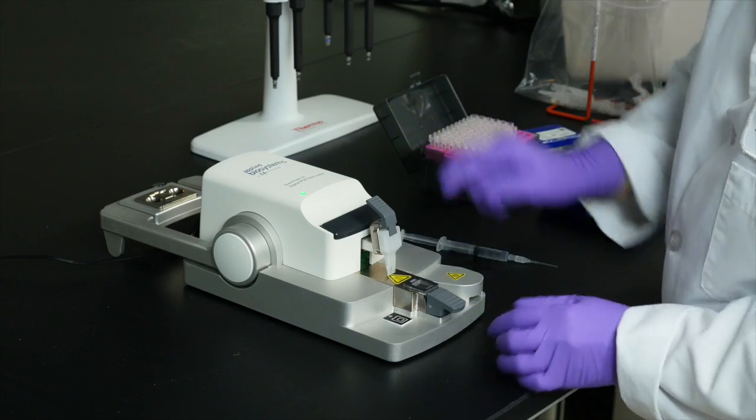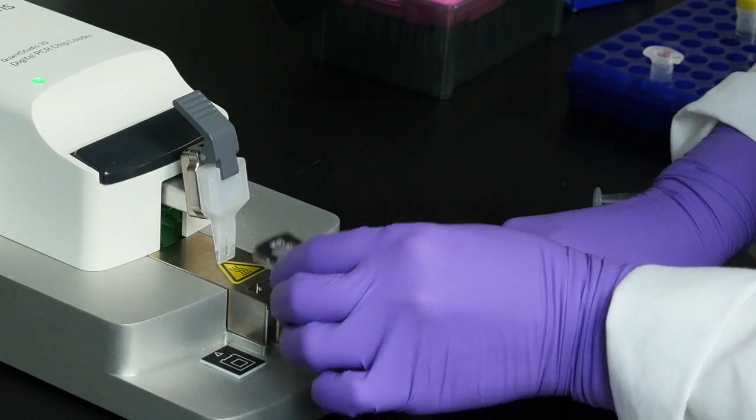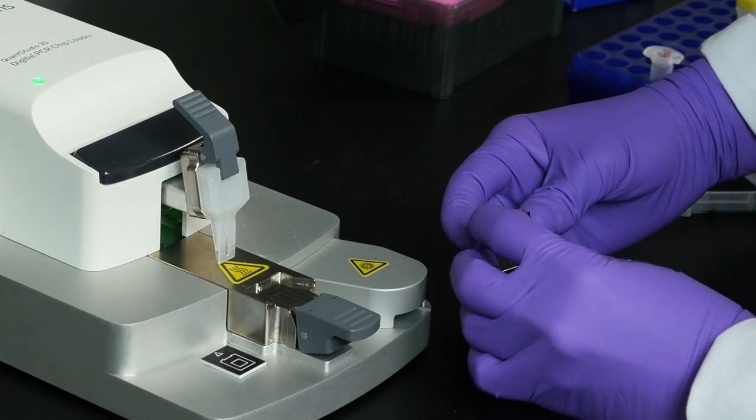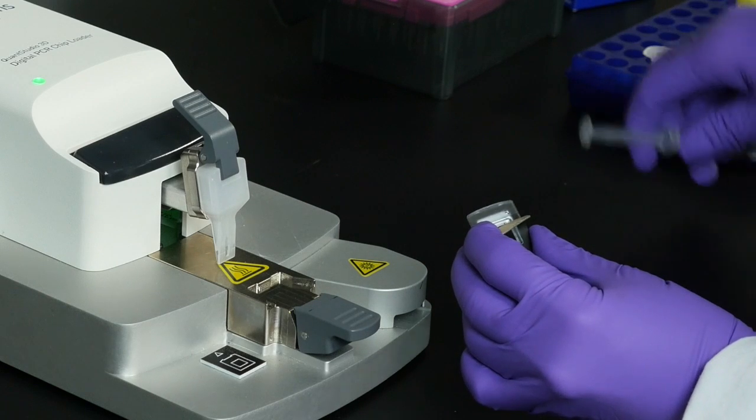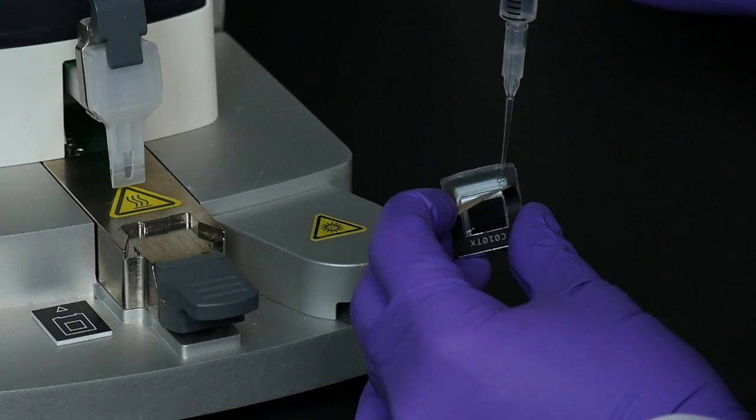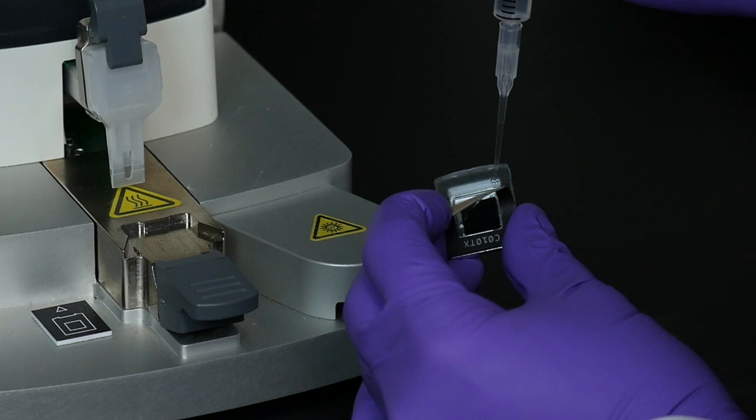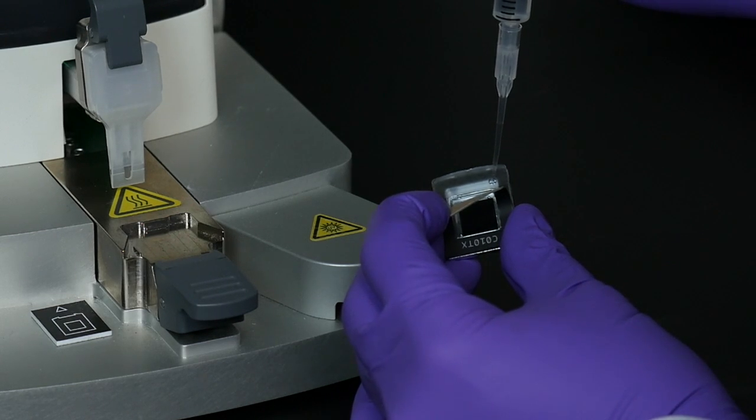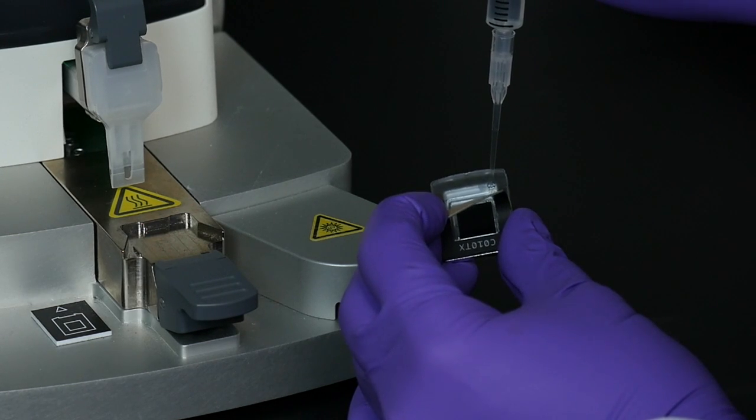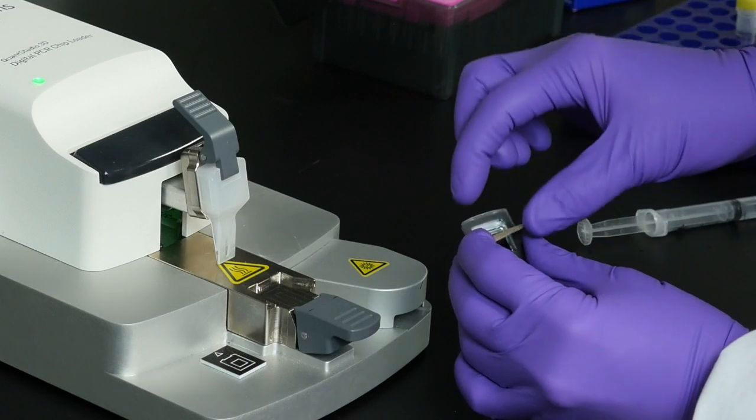The chip is sealed with an adhesive label on the version 2 chip lid. To fill the chip chamber with immersion fluid, hold back the top of the chip label in order to access the loading port. When the chamber is full, remove the backing from the label.